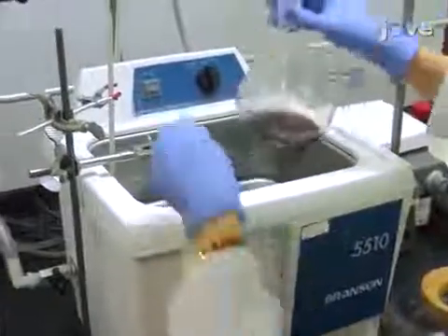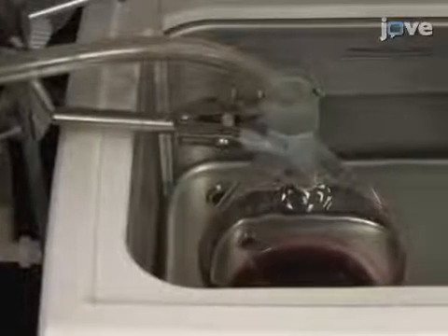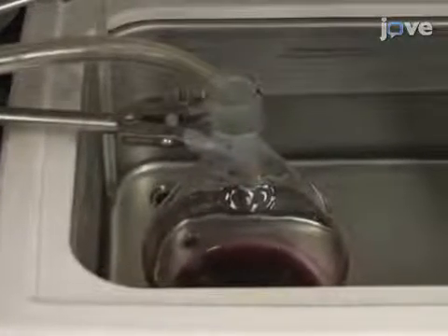Place the flask in an ultrasonic bath at 25 degrees Celsius. Under continuous nitrogen purging in subdued light, sonicate the mixture for 20 minutes at 42 kilohertz and 135 watts.